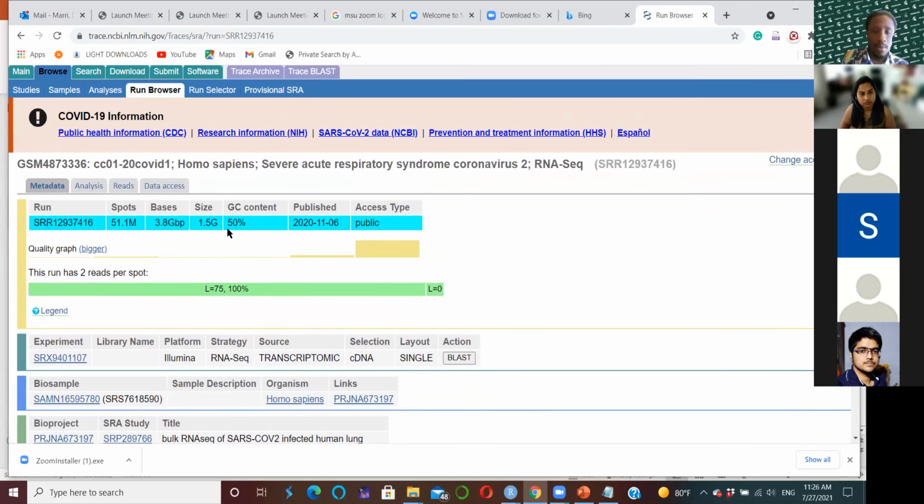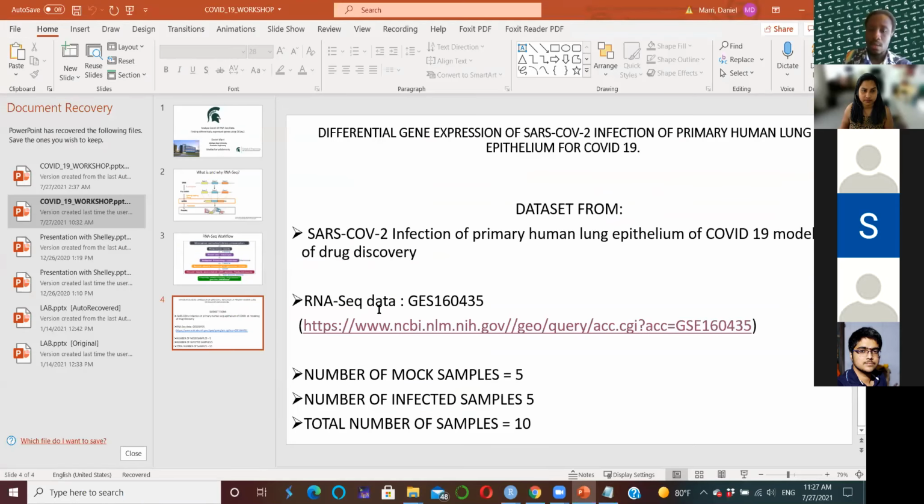Okay, and I don't know if I'm answering your question. This is pretty close. Thank you. All right, so the server here will link you to the RNA-seq data set, and from there you can understand the summary and all the details they used in generating this data set.